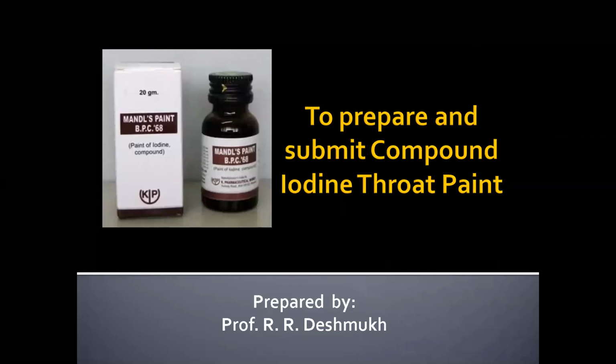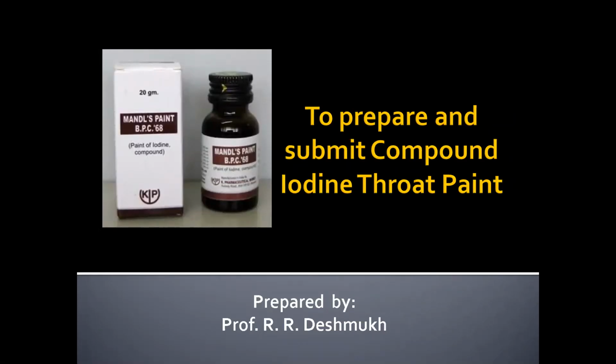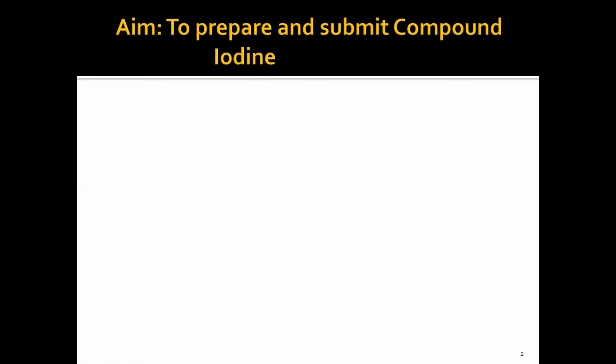Hello dear students, today we are going to see how to prepare and submit compound iodine throat paint. So the aim for today's practical is to prepare and submit compound iodine throat paint.